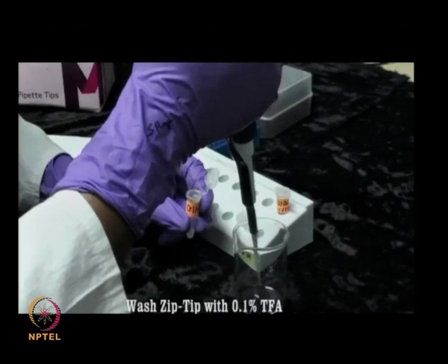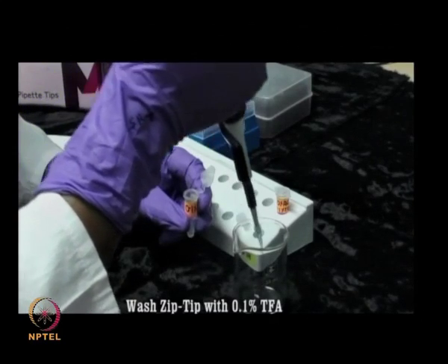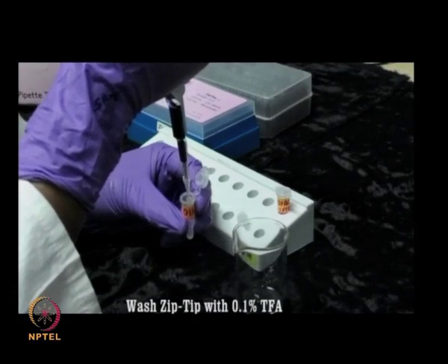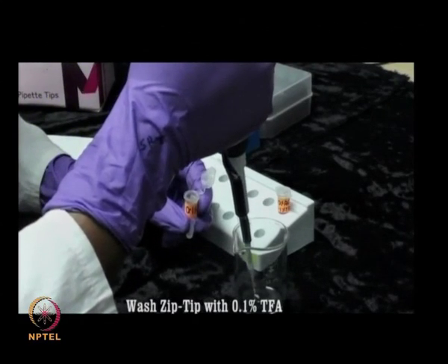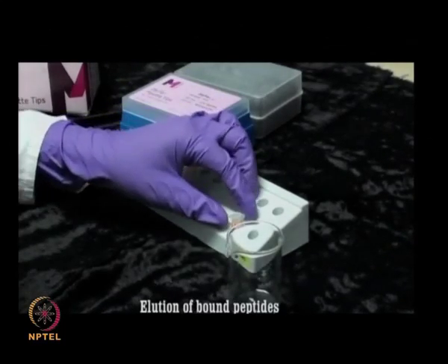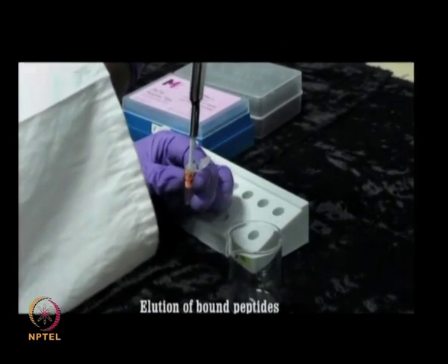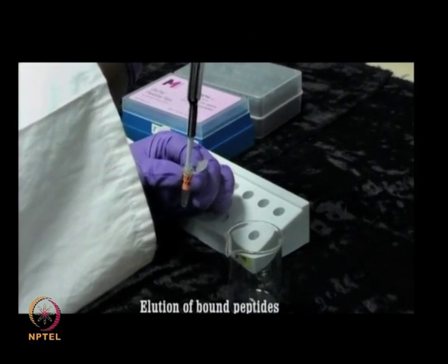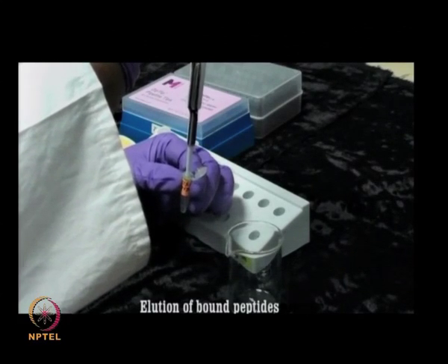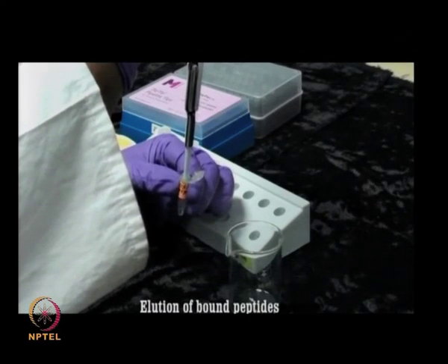So, samples are passed through the activated ZipTip, where they are captured in a bed of chromatography media. Now, wash this C18 tip thrice with 10 microliters of 0.1% TFA to remove the salt and other interfering components. So, these steps ensure the salts and detergents are washed away, and finally, samples can be eluted in a very small volume of solvent.